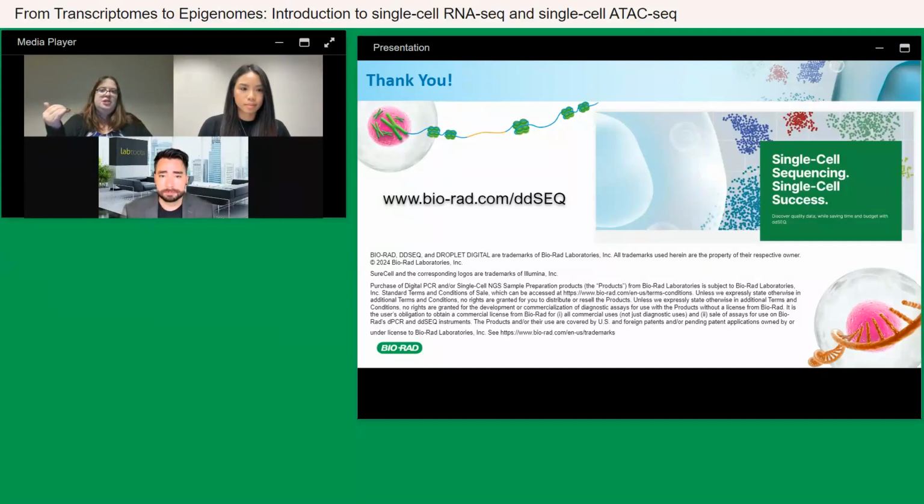And so the final gene counts that you'll get will include information both from the mature and immature RNAs. So if you were to compare the gene counts from the reads that excluded introns to the gene counts after you included the introns, that difference can give you some insight into potential immature mRNAs compared to the mature mRNA counts in your sample.